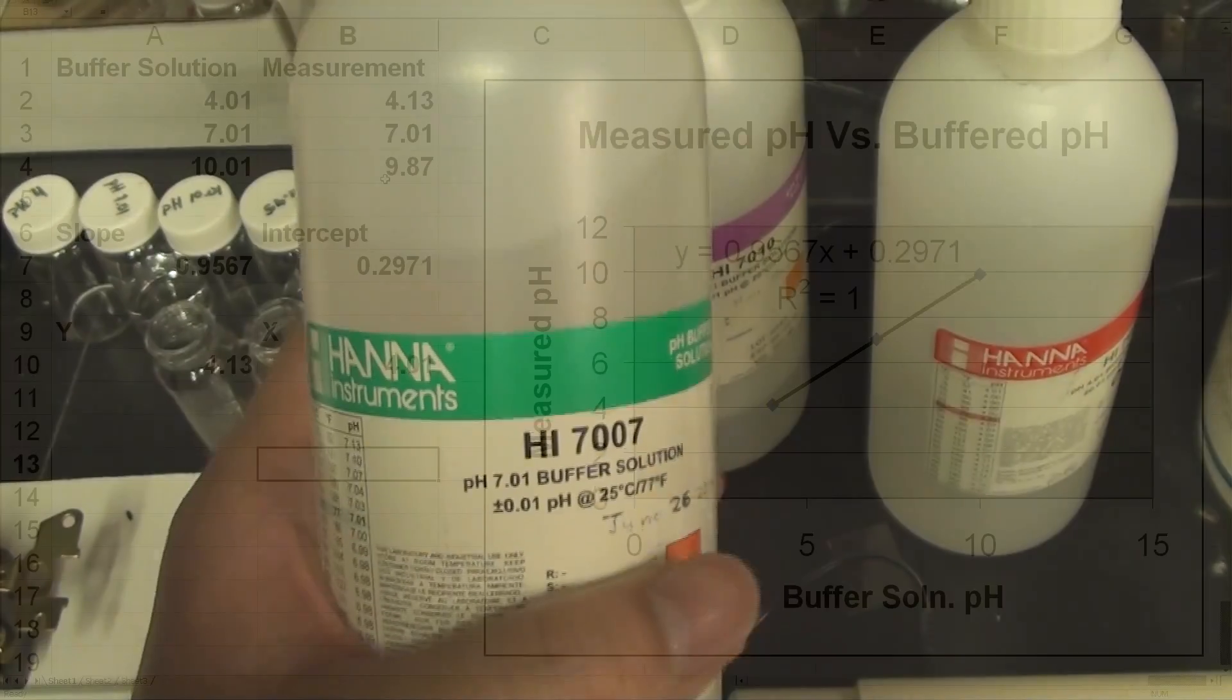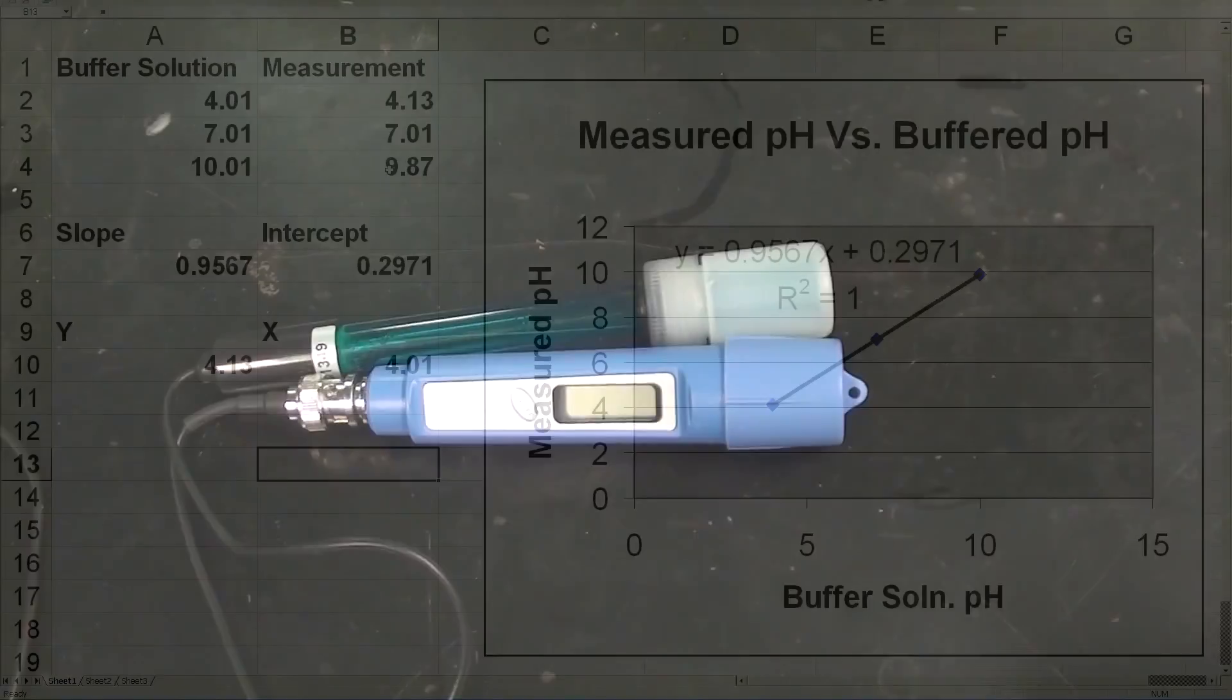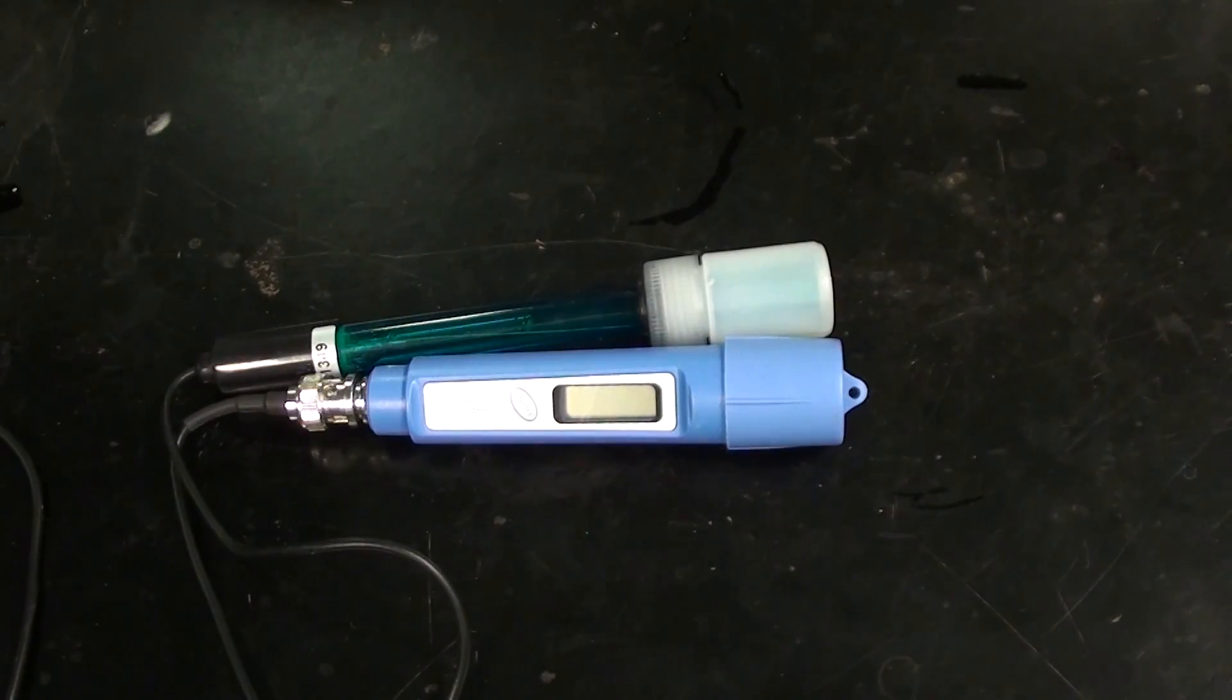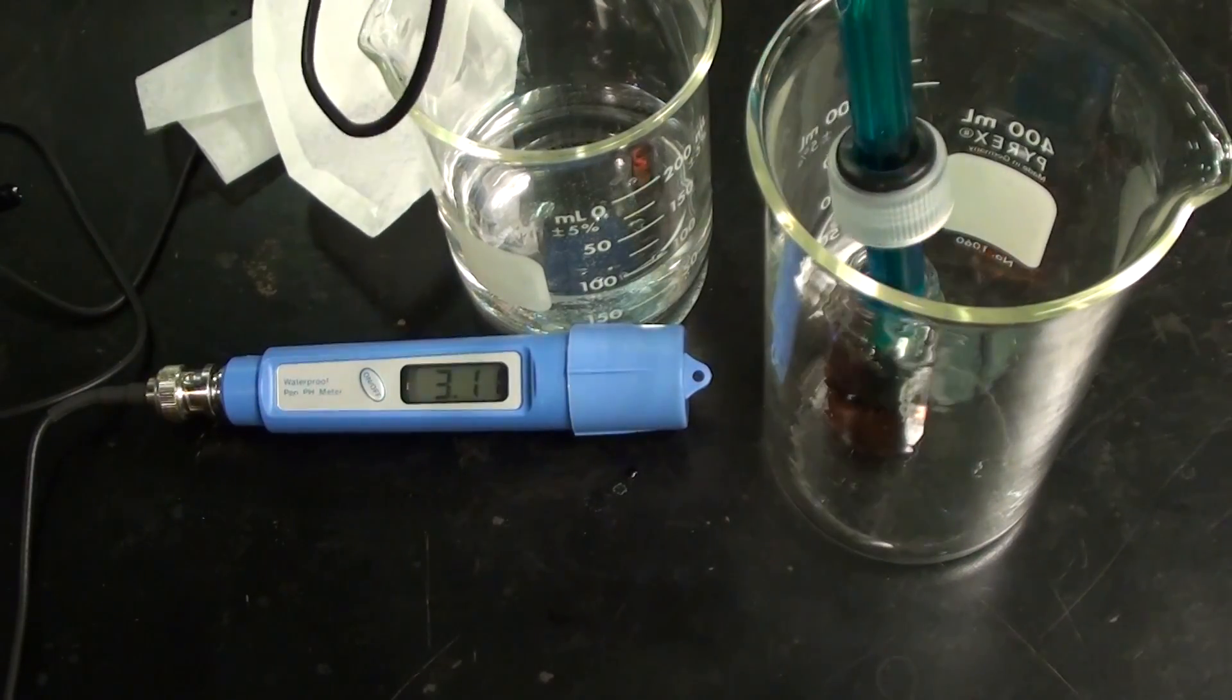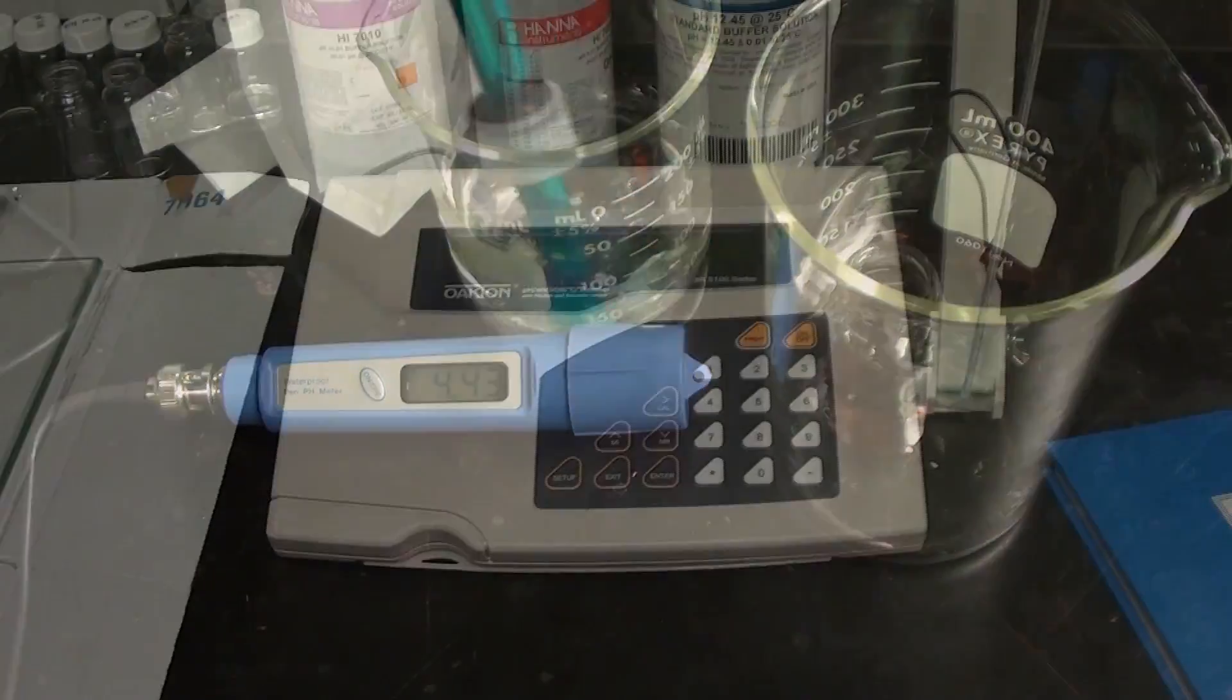Nonetheless, with some buffer solutions, a spreadsheet and some thought, we've turned a $40 pH meter and electrode we got off eBay into a usable analytical tool that can compete with a several hundred dollar model.